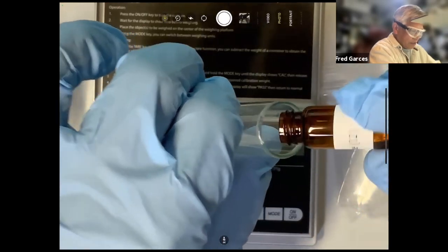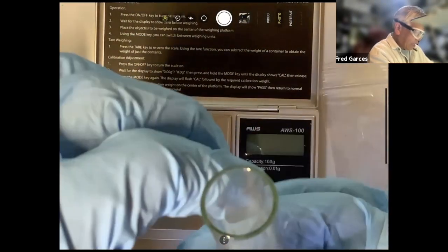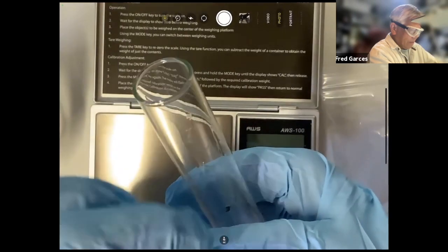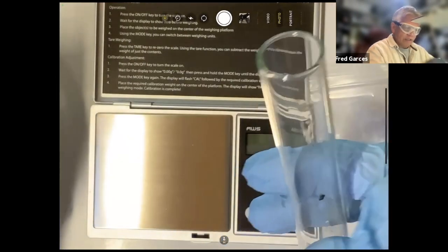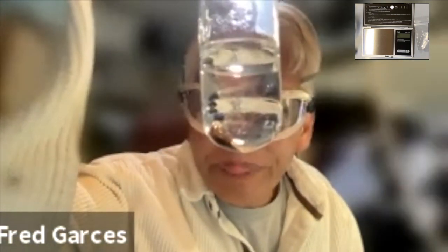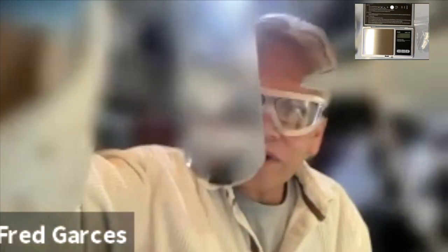At which point the iodine will go in one of the liquids. So what I have here is, yeah. Okay, if you look real closely, the iodine's on the bottom and it's sort of dissolving in one of them.